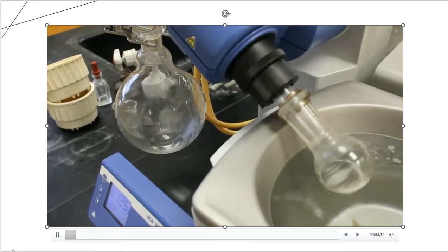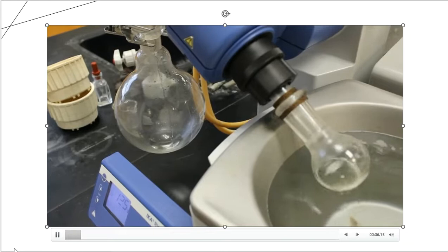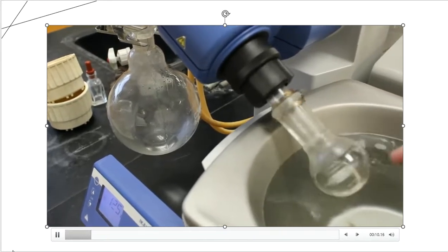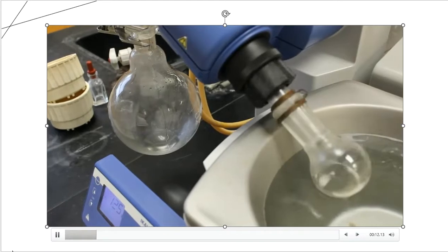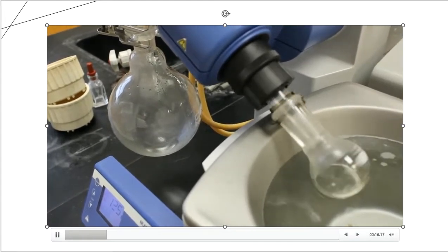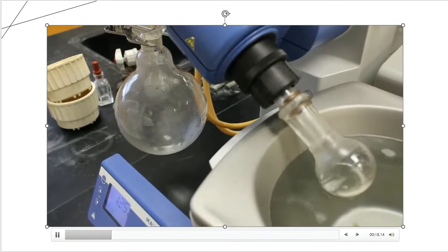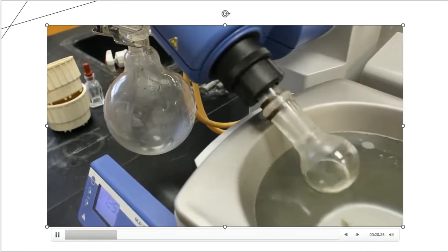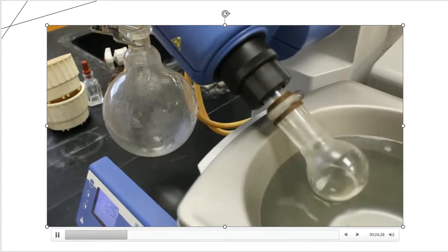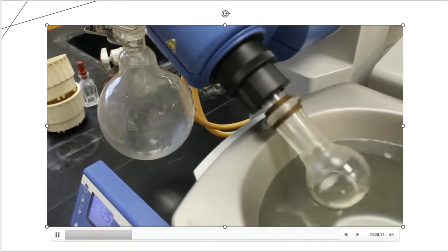All right, so the simple distillation is actually going now. The rotary evaporator is doing its job. This solution in the boiling flask that you see to the right-hand side is withering away because the removal of the methylene chloride is making it shrink in volume. And sooner or later, I'm just going to have product left over with no methylene chloride at all, and that's really what I want to see.